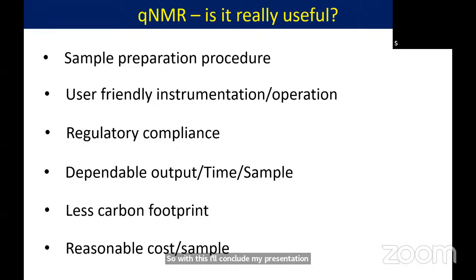I hope I made myself clear in proposing qNMR as one of the techniques for the future, because as a director of NMR Research Center for the last 5 years, if I closely observe the market, the number of samples coming to our center for qNMR analysis are consistently increasing for different reasons. Let us say a production unit wanted to know the proportion of starting material and ending material, and how much quantity of solvent is there in the product to be exported.